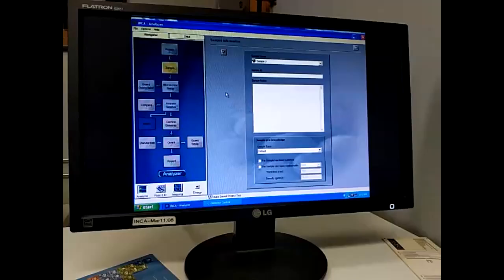So now what I'm going to do is load a new sample in there and show you how the EDAX works and also the backscatter operations. So bear with me. Okay, so this is our EDAX system. I'm just going to give this a quick pause.